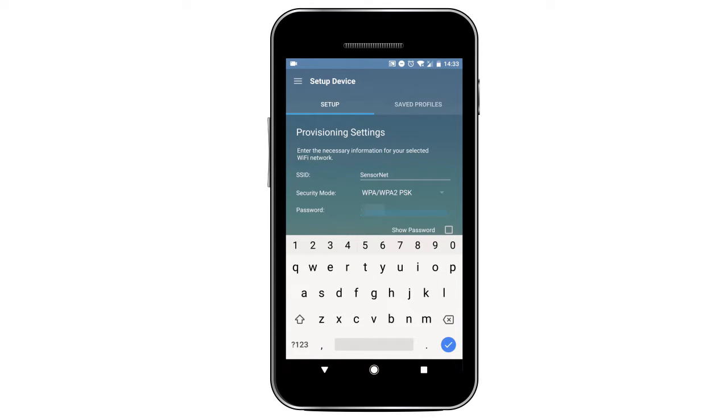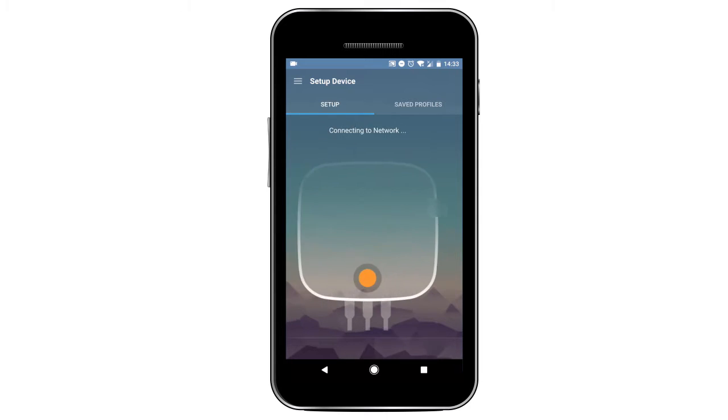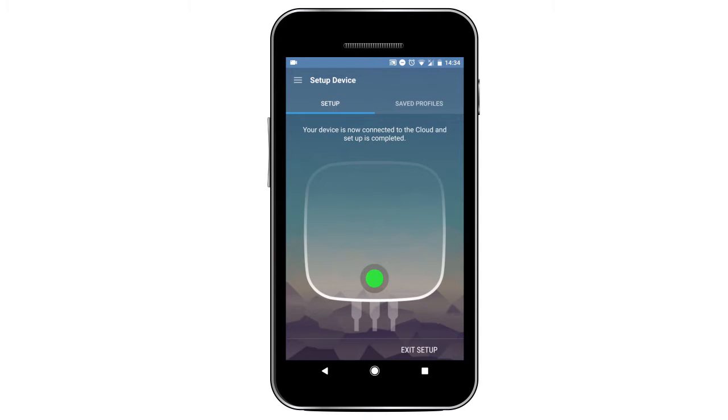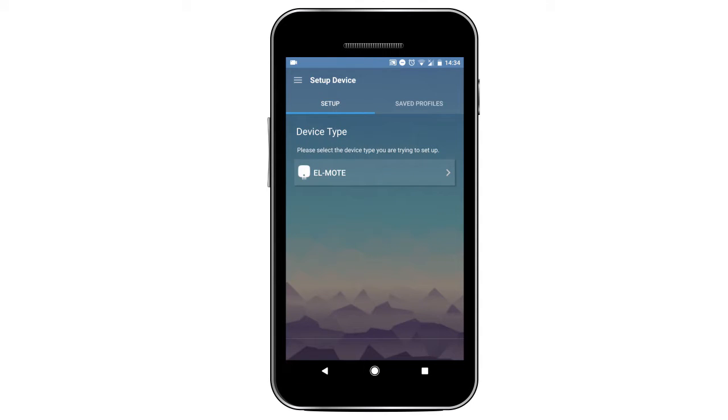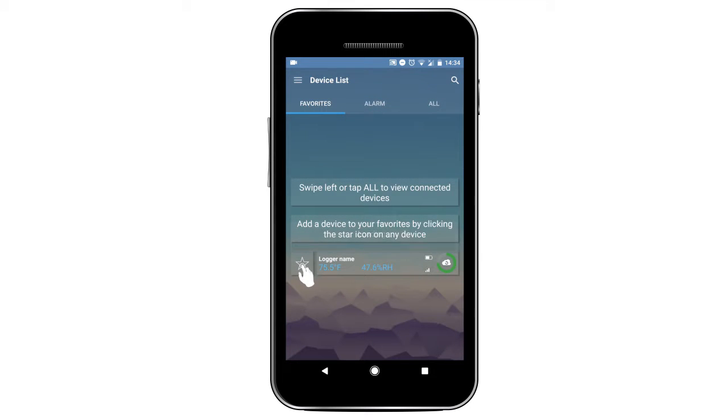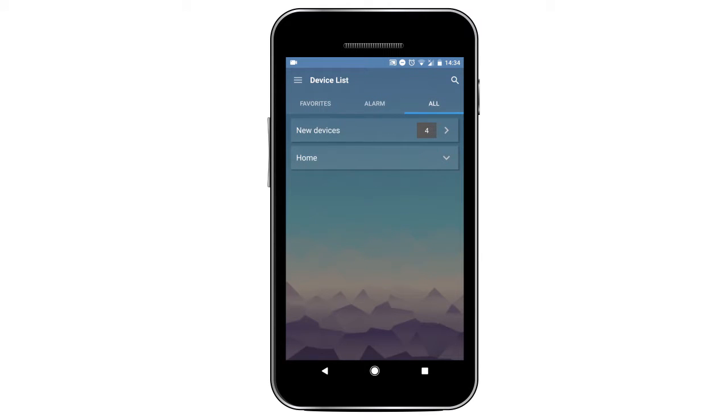You will then be asked to select your Wi-Fi and enter your Wi-Fi details. Then click Next to connect your logger. The logger will beep and setup will be complete. Create a profile name and click Exit Setup.